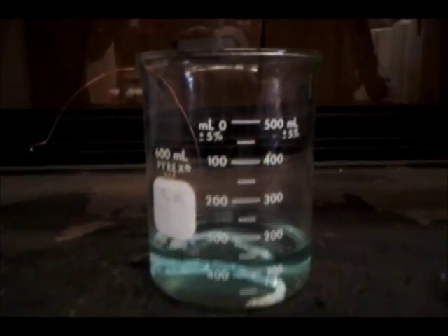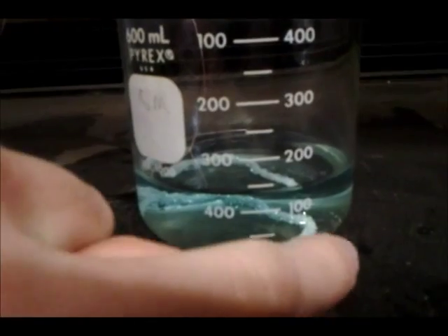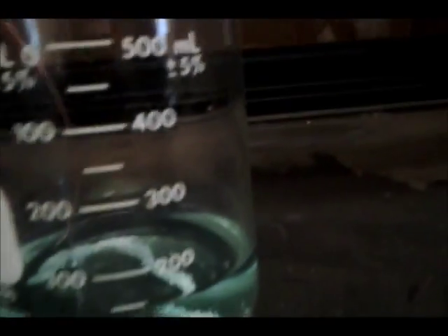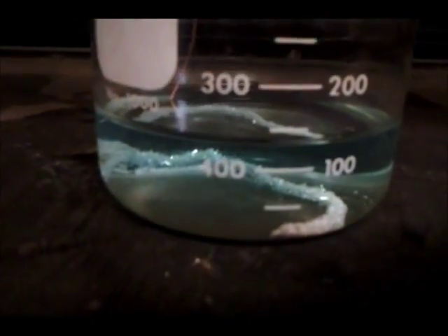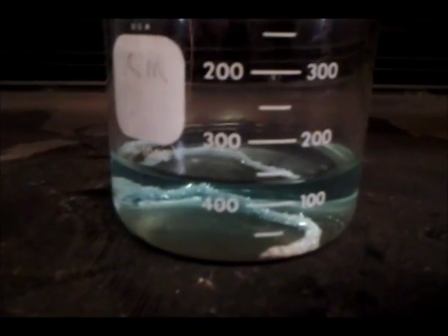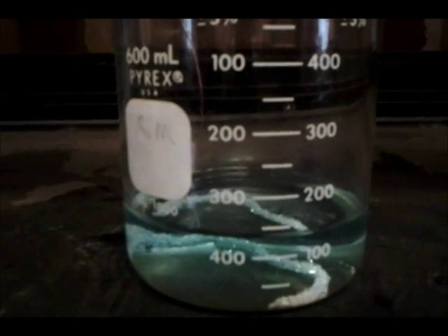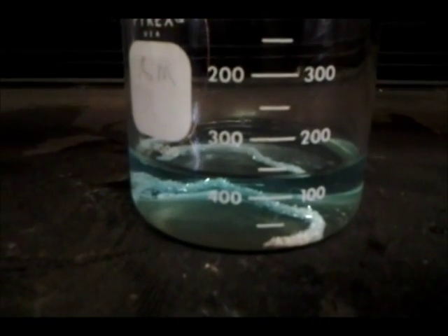Okay, so we left this overnight, and the end result we got was copper nitrate and silver, which is that stuff right there. And as you can see, it turns into a whole bunch of crystals. It seems that also in the process, the copper also fell to the bottom of the beaker and is detached.